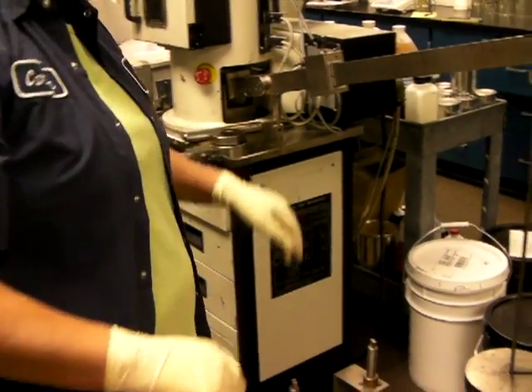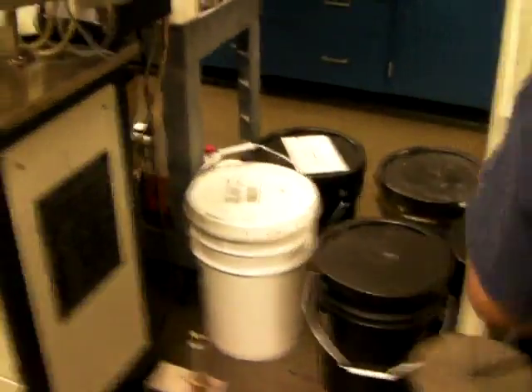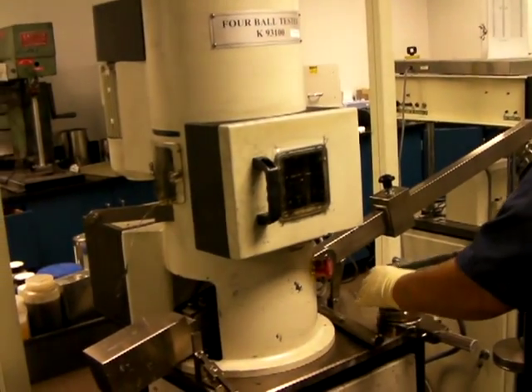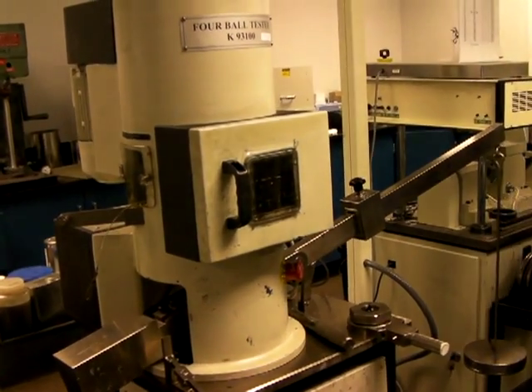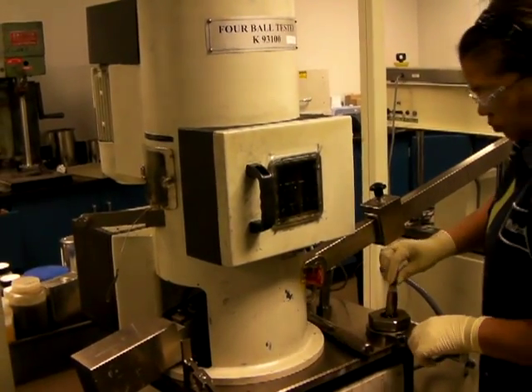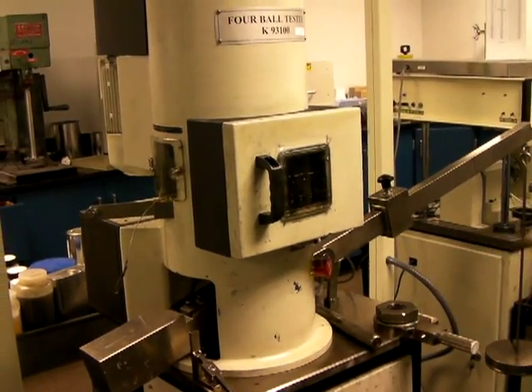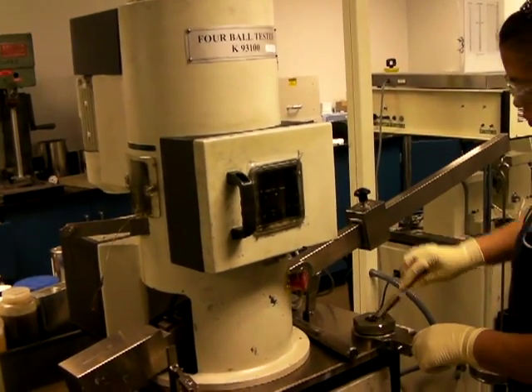We're going to run this test at what load? 620 kilograms. Let's run it at 620. This is the machine. The reason we're running it at 620 is because we believe this grease will weld at 800 kilograms, which means it should not weld one step below that — 620 kilograms. There's only one stage above 620, that's 800. So if it doesn't weld at 620, the weld point would be 800 kilograms.